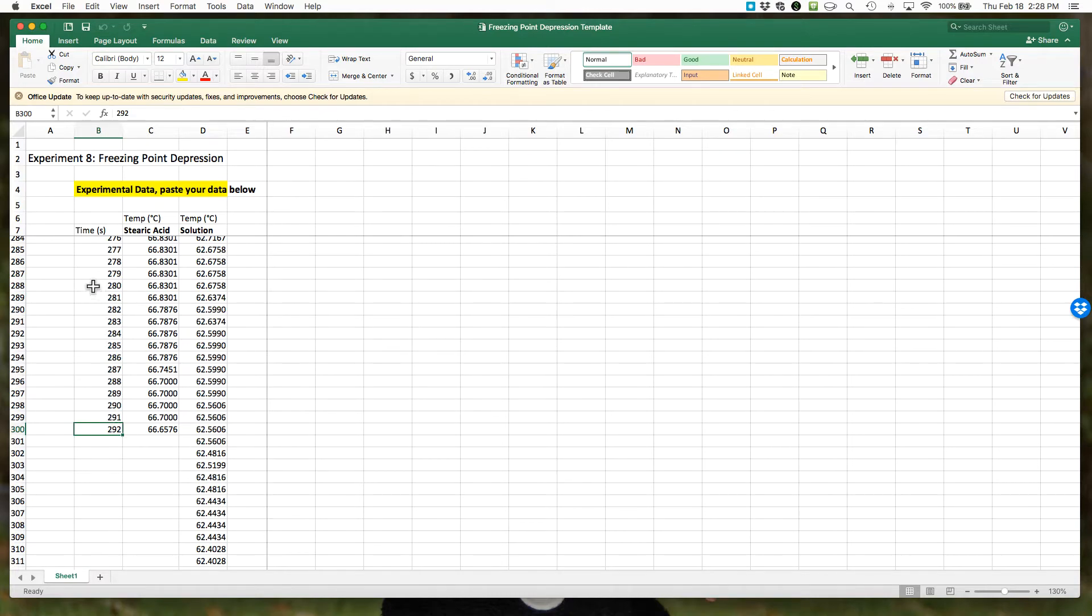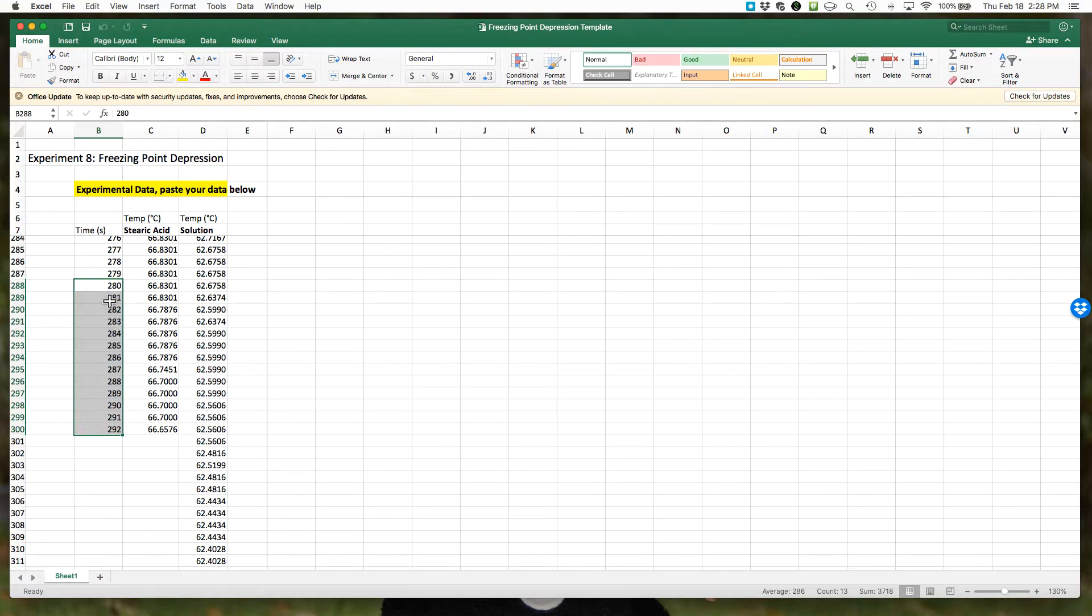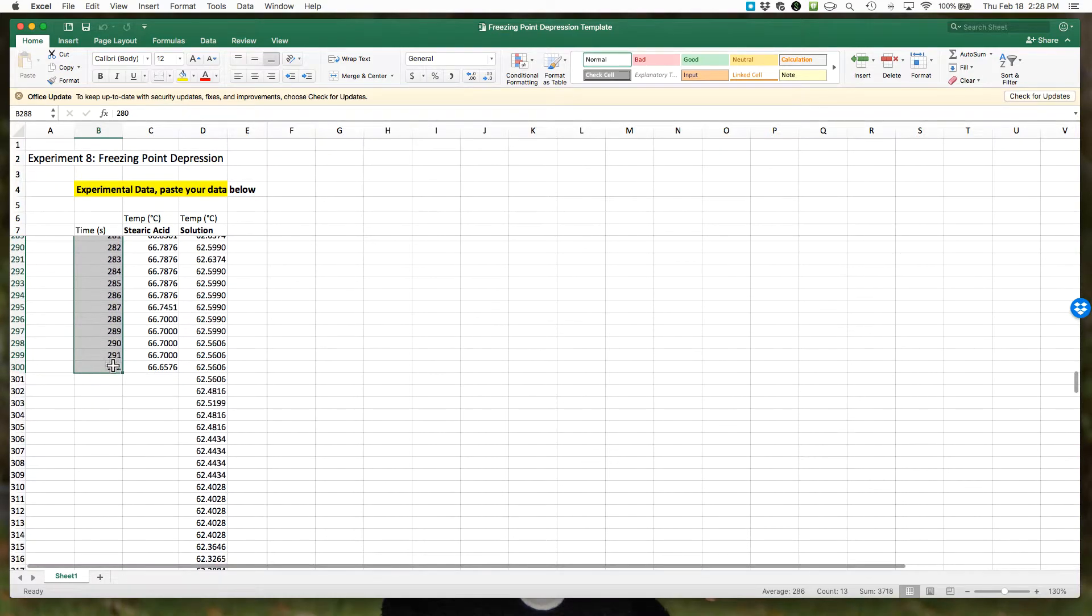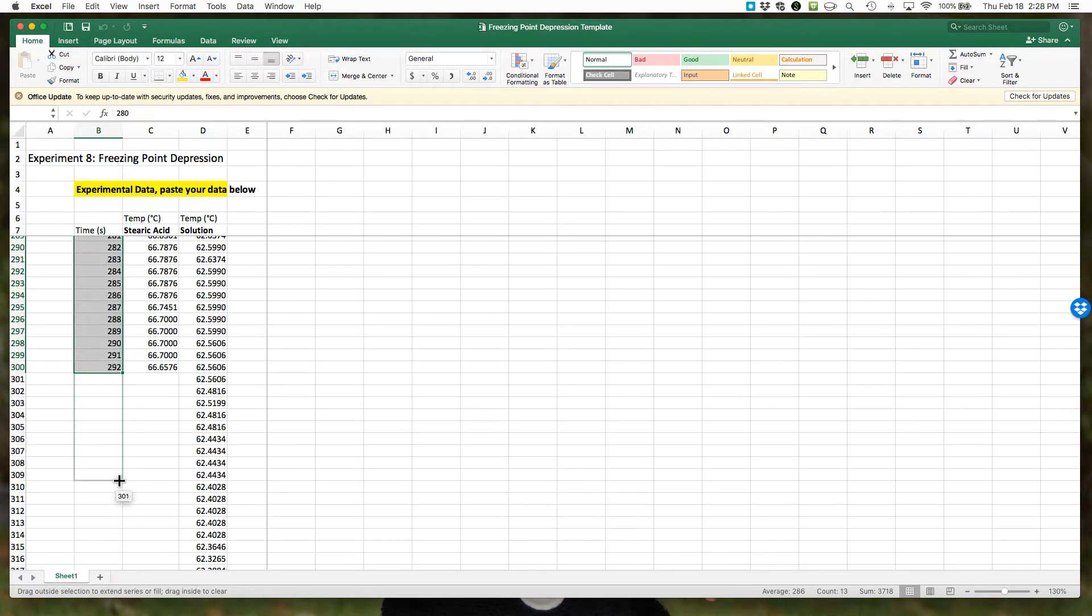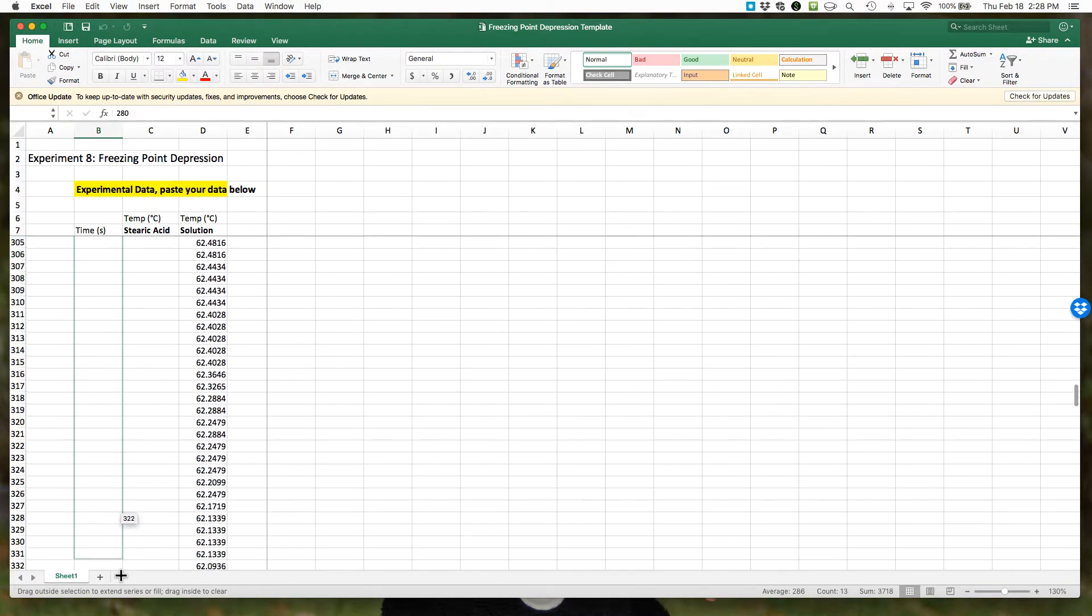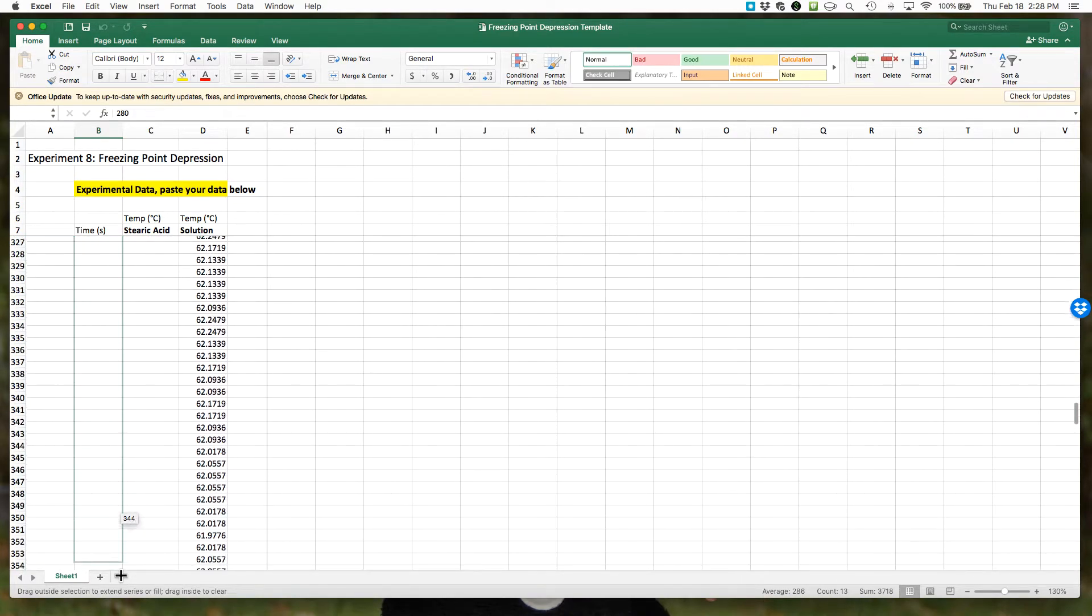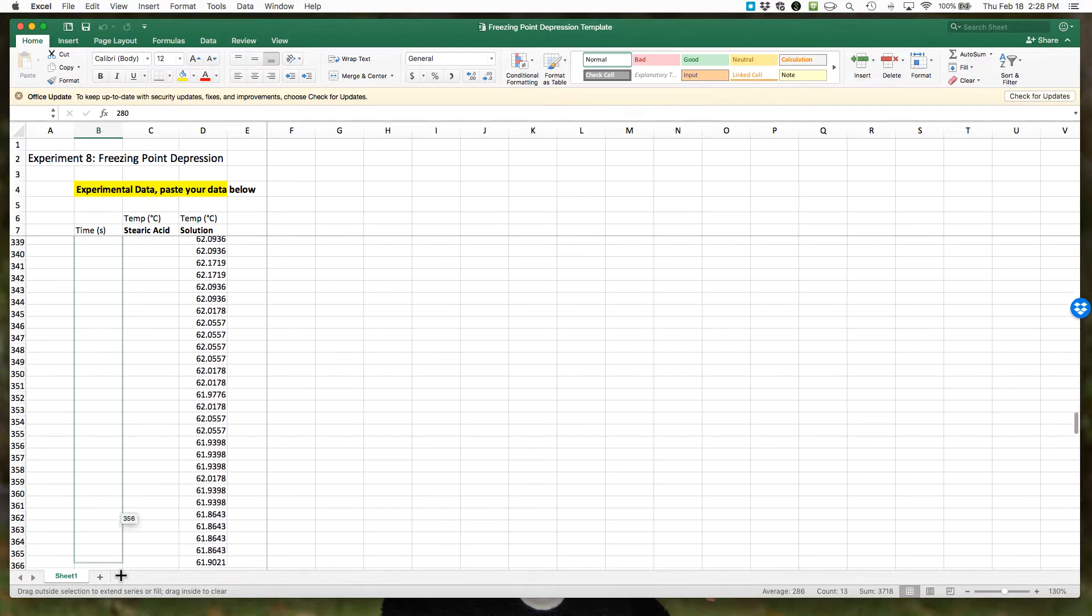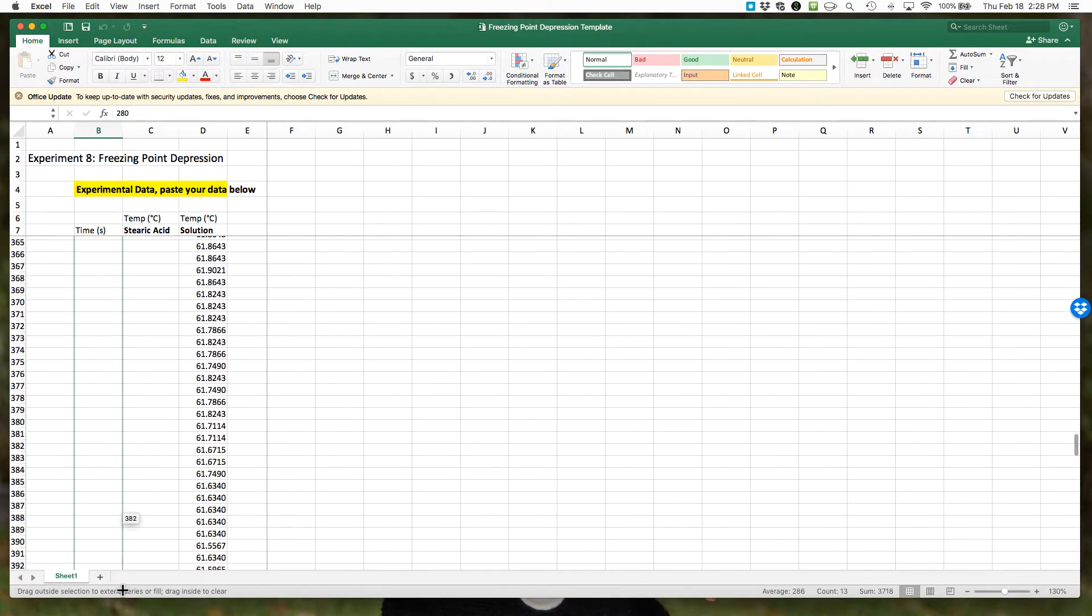We need this to continue to the end of the solution data. The way we can do that really quickly with Excel is, because each cell is just the addition of one second, I'm going to highlight a bunch of cells here. You need a few, and then I'm going to come down to this box with the little green box, watch my cursor change, and just like filling a formula I'm going to fill this down.